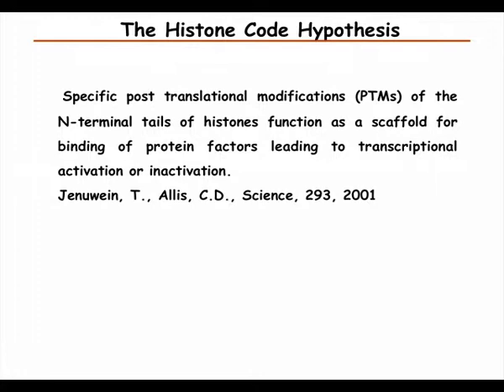When we look at proteins, do we also enrich for modifications? Let's say we are looking for the phosphorylation sites, are we going to enrich for phosphorylated proteins before we do the analysis?